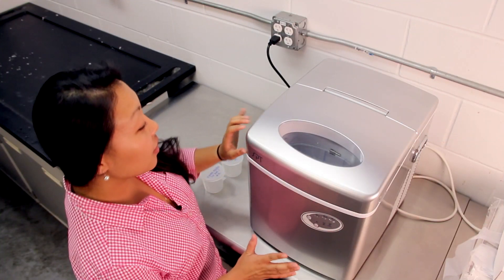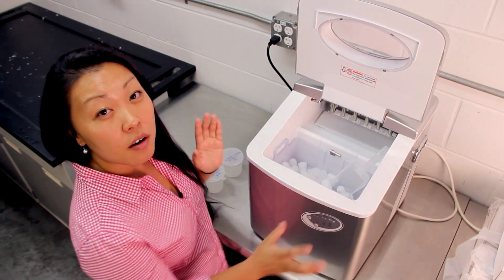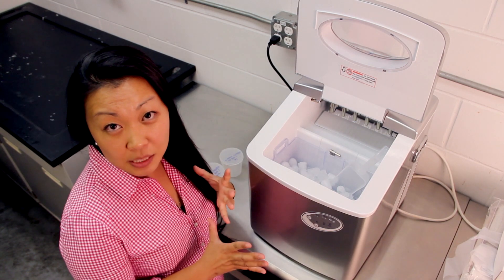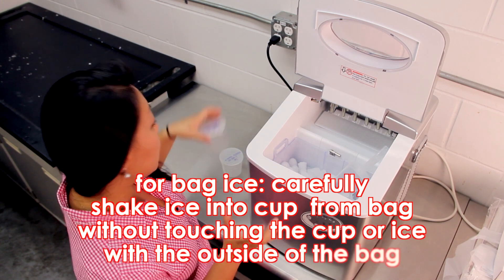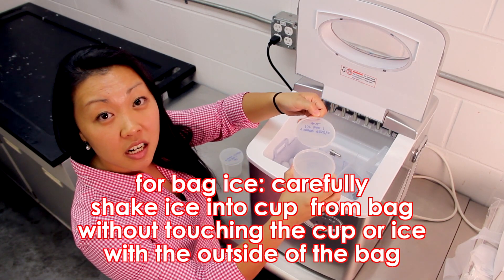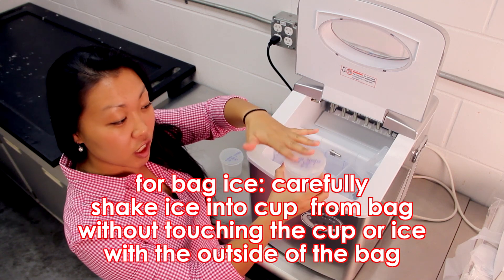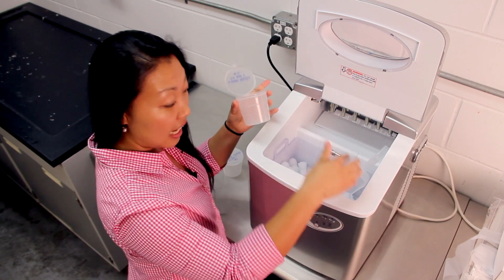Now we can go ahead and start sampling our ice. I have an ice box here with an ice scooper. For those of you that do not have an ice box with a scooper, you may have an ice dispenser — simply pop open the specimen cup, put it right under the dispenser, and add some ice. For this purpose, I do have an ice scooper.